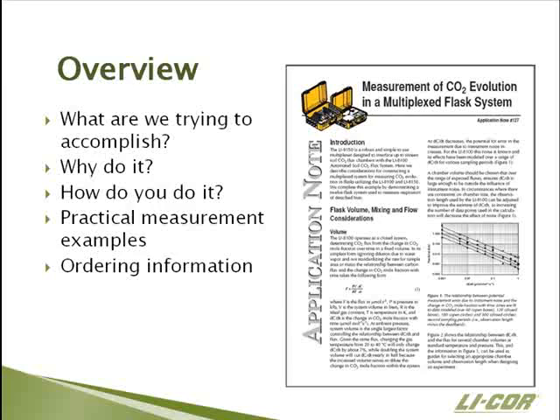Then I'm going to move into how you actually physically make the measurements, optimizing the 8100 system to make the measurements, how you actually configure the 8100. There's some plumbing changes that are made, and there's some repurposing of software fields. And then I have two practical measurement examples to show you where we measured CO2 fluxes from isolated detached fruit. And then we'll talk to you about ordering information, sort of the parts that you can get from LI-COR that are necessary to make these measurements.